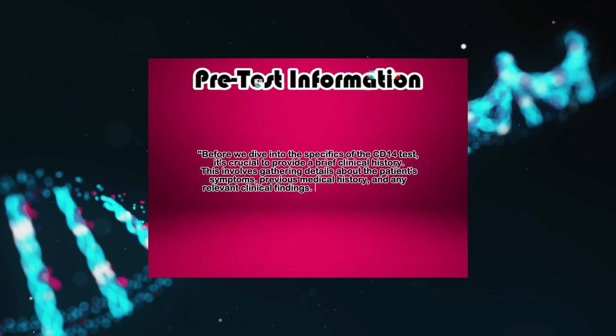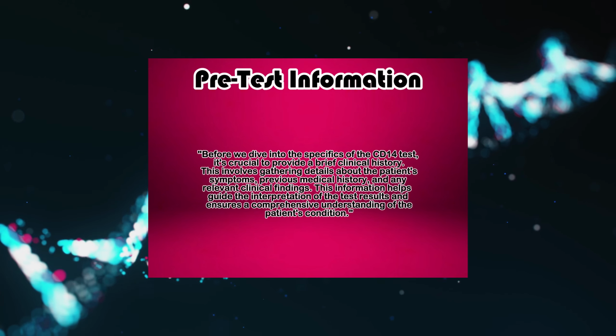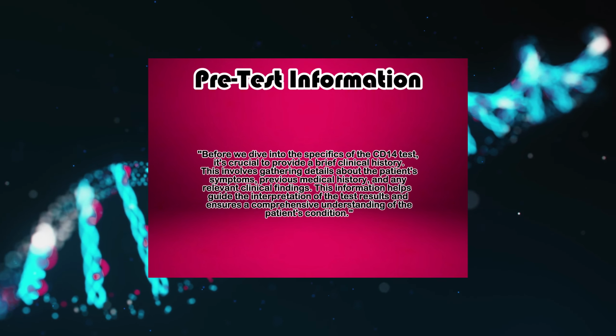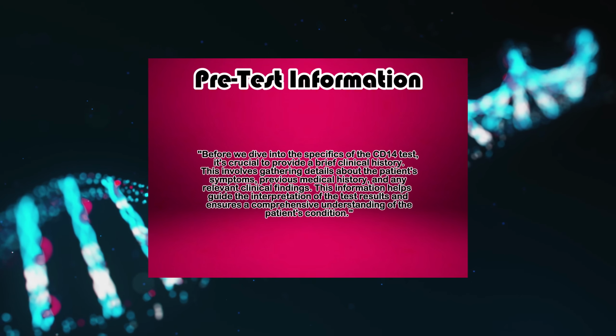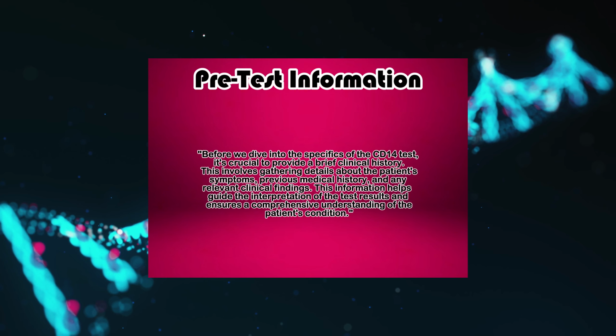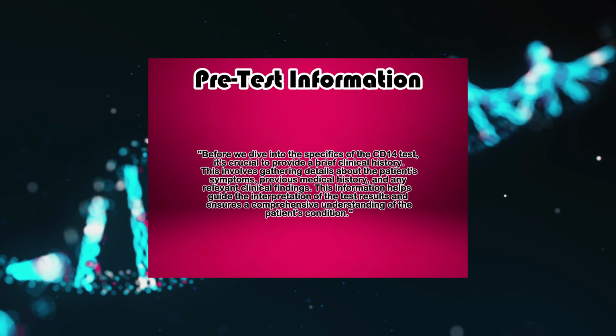Let's get started. Pre-test information. Before we dive into the specifics of the CD14 test, it's crucial to provide a brief clinical history. This involves gathering details about the patient's symptoms, previous medical history, and any relevant clinical findings. This information helps guide the interpretation of the test results and ensures a comprehensive understanding of the patient's condition.